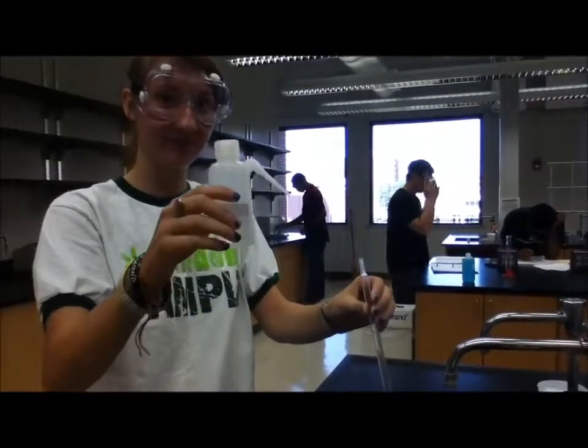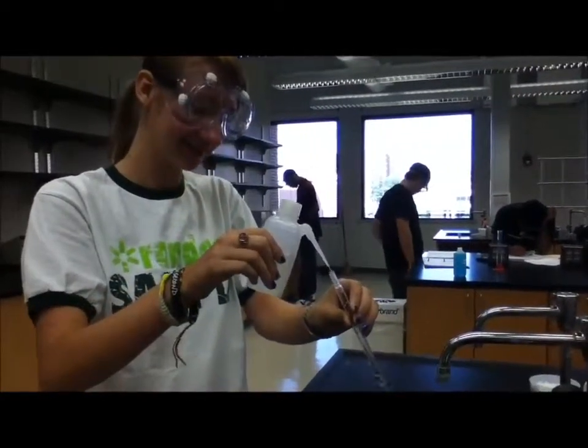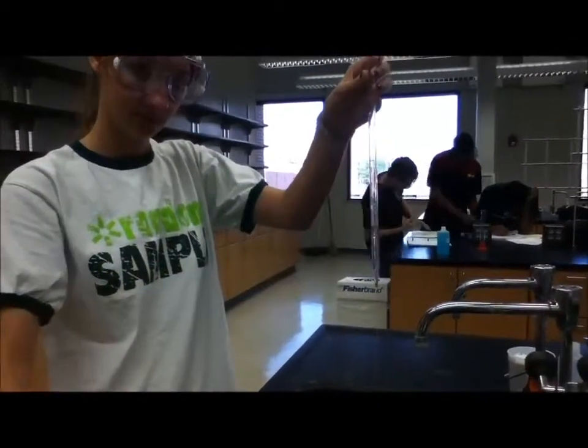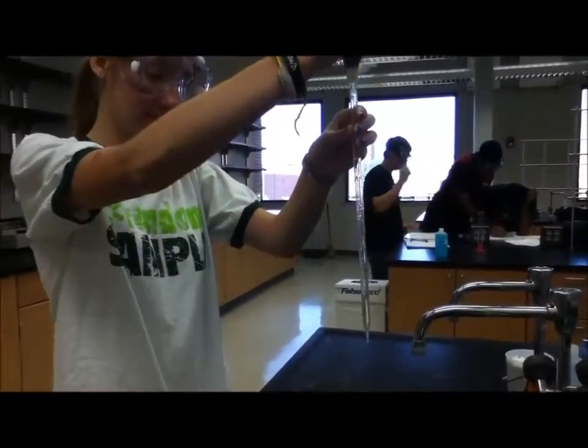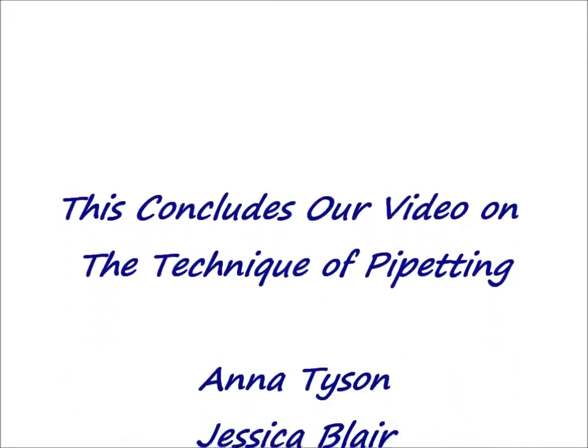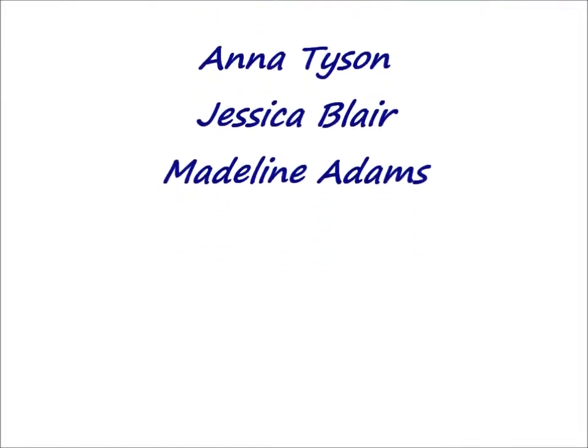Here is Jessica properly cleaning the pipette. Rinse lab materials with distilled water. Place the bulb on the pipette and drain the liquid. Repeat this process three times.